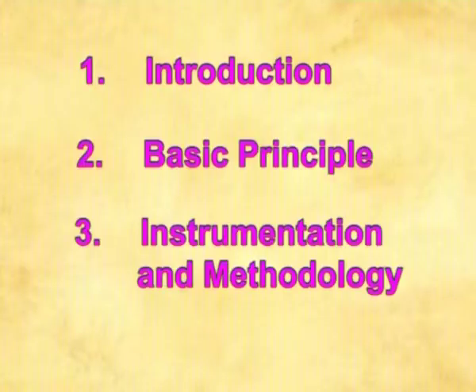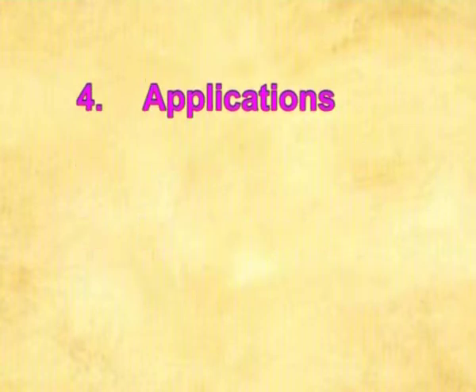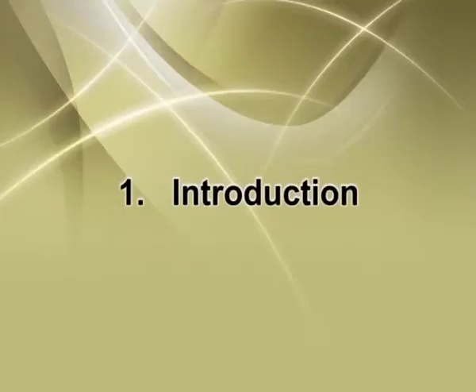The present lecture is on the topic entitled Colorimeter. This topic comprises the following 5 sections: Introduction, Basic Principle, Instrumentation and Methodology, Applications and Conclusion.